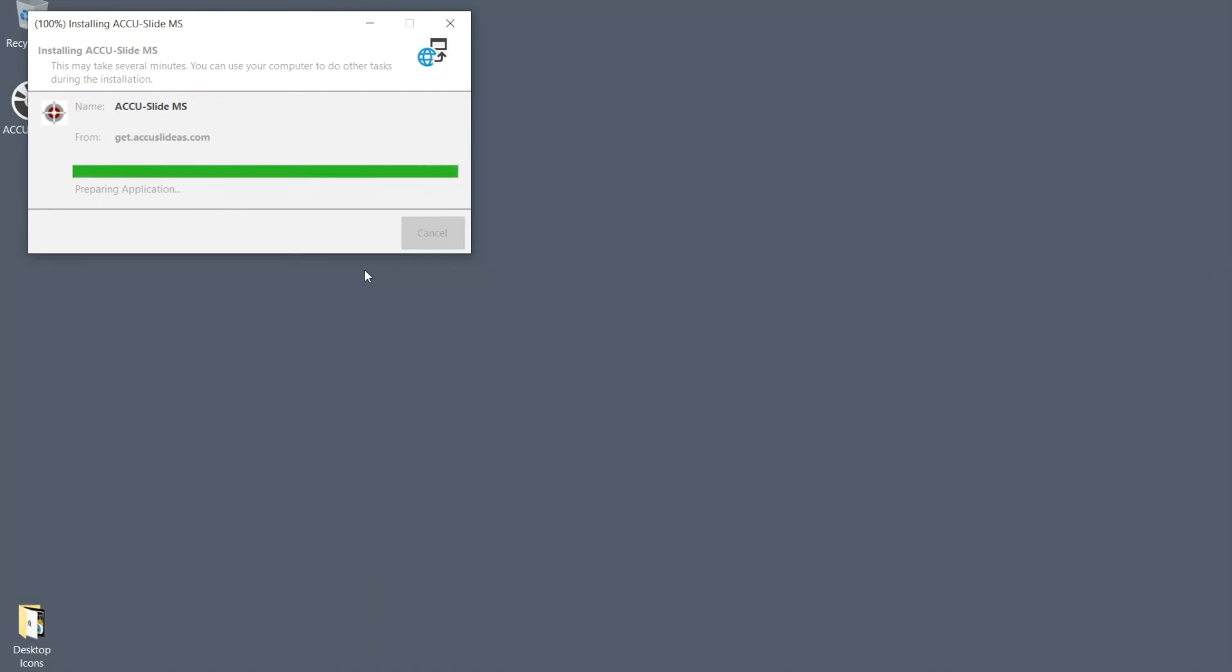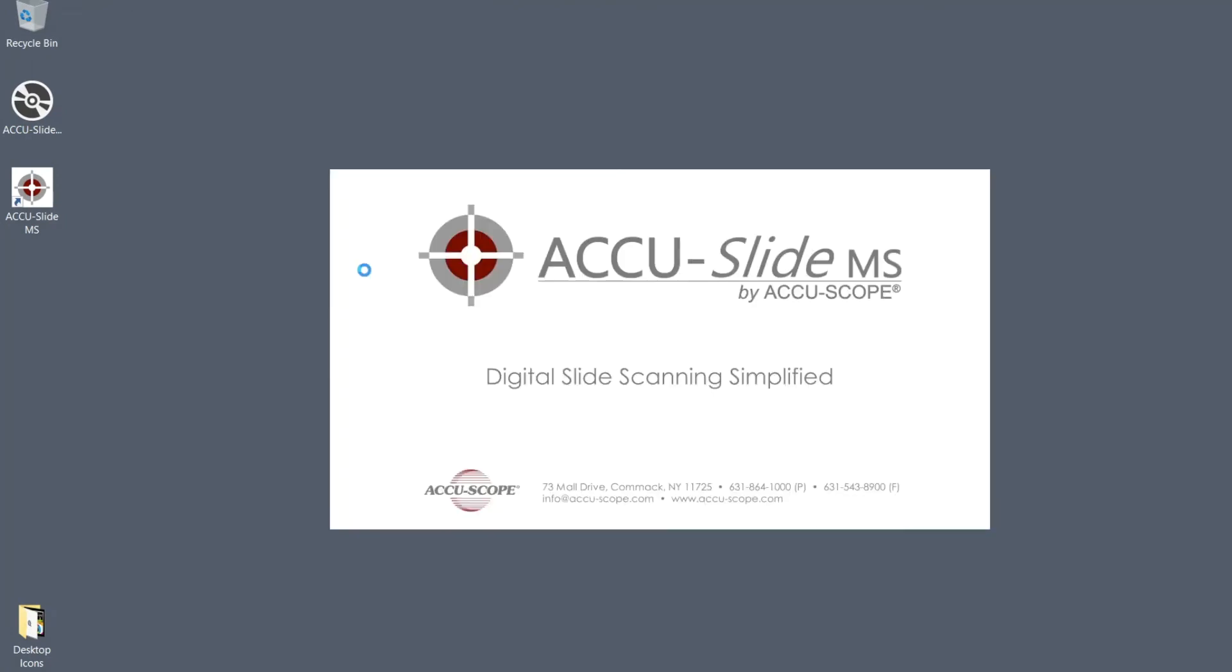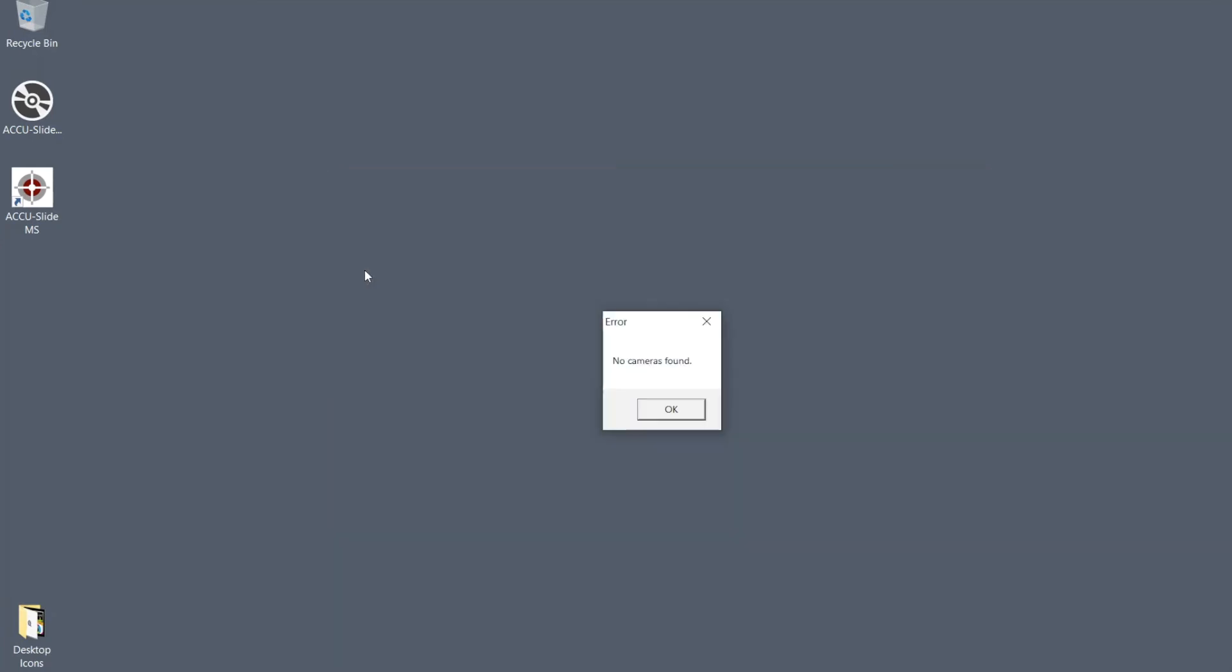Simply follow the steps of the installation wizard. After installation, AccuSlide MS will launch automatically. If you do not have the camera attached, you will see a message that no cameras were found.